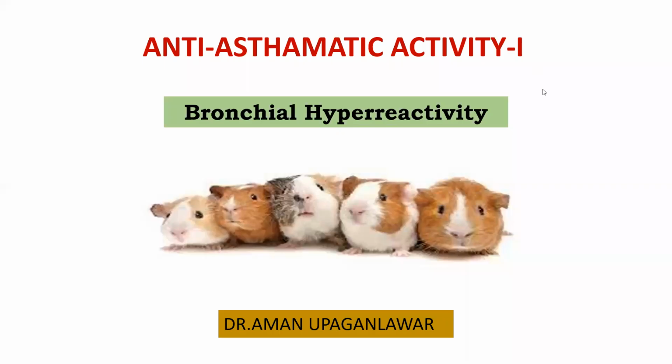Hello friends, today we are going to discuss one important and very simple method for the screening of drugs which are acting on respiratory activity, and under that the method is bronchial hyperreactivity. Now first let's see what is the principle of this test.